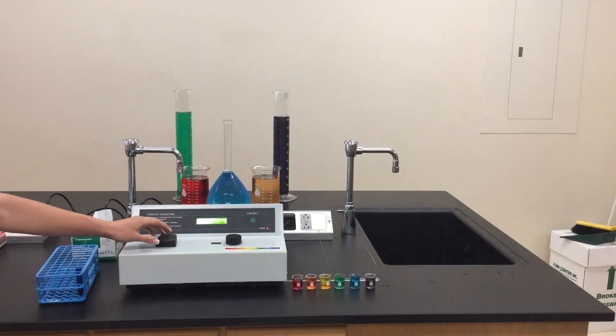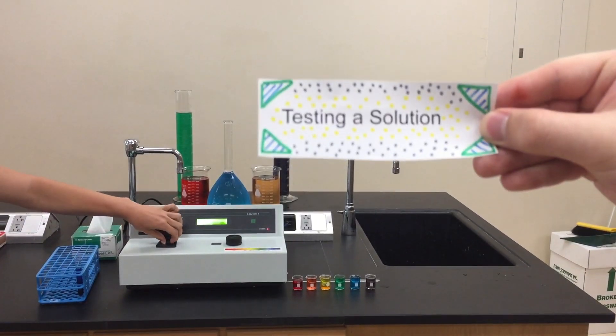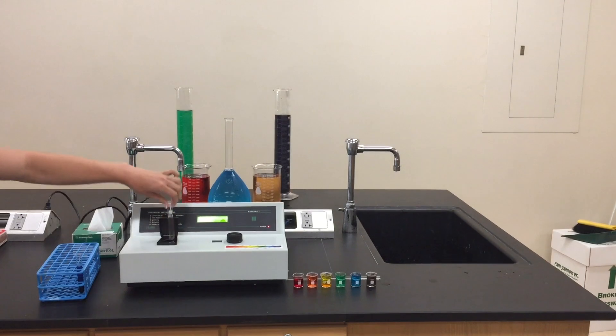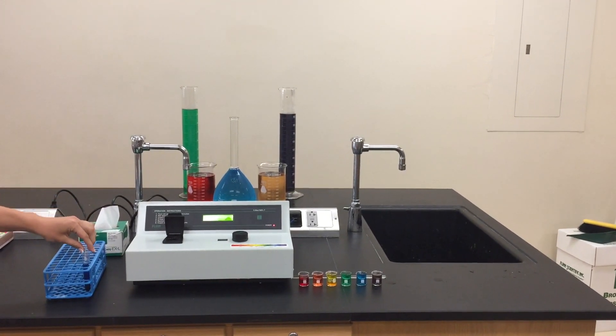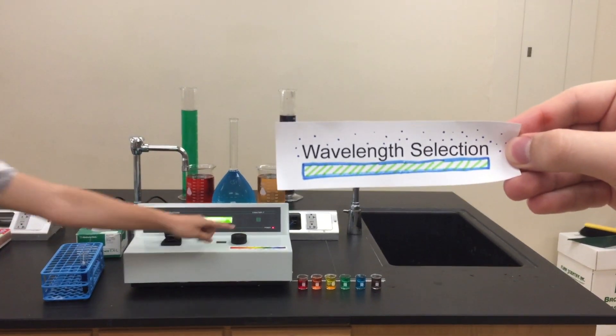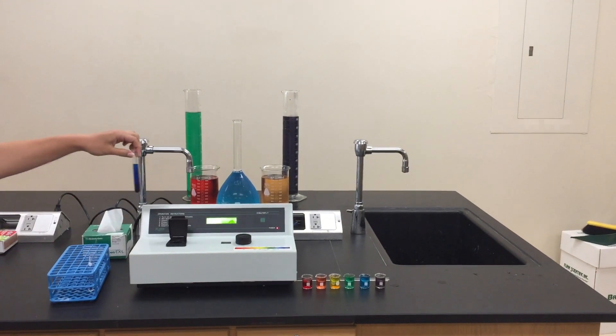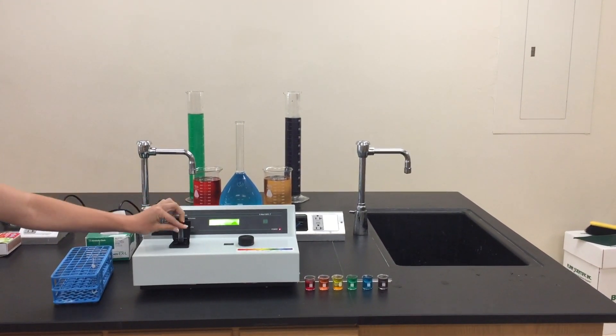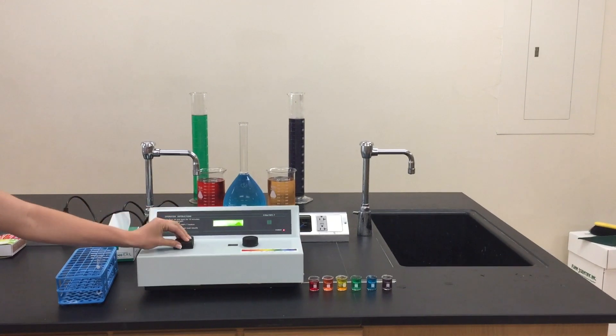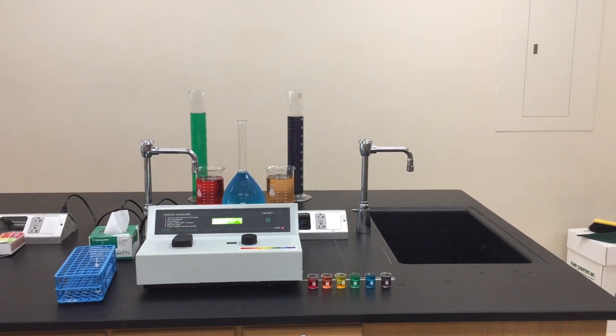Now the machine is set to test your solution. Make sure the wavelength knob is set to the appropriate wavelength for your experiment. Place the cuvette with your solution in the sample holder, then watch the display for your measurements.